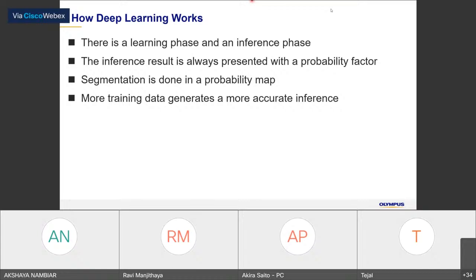And also in the inference image, as I mentioned in this slide, there is the probability factor, the 1 or 0.9 kind of thing, so we can see how varied it is from the probability factor from the image. I'm not sure whether I am answering correctly or not.